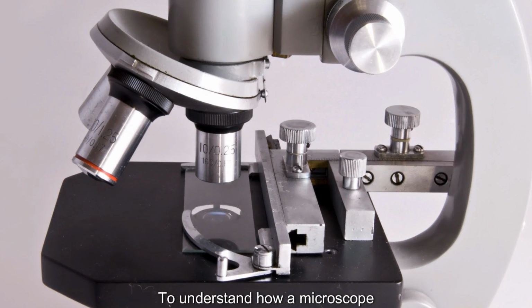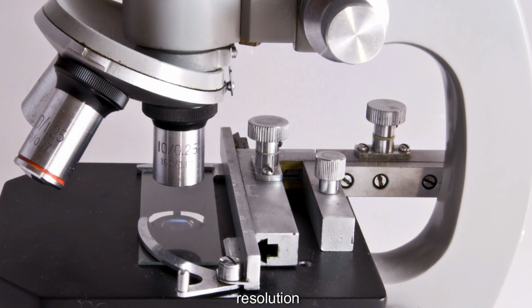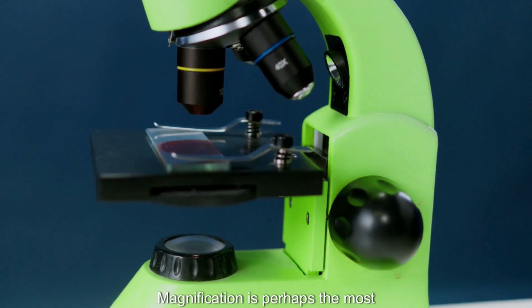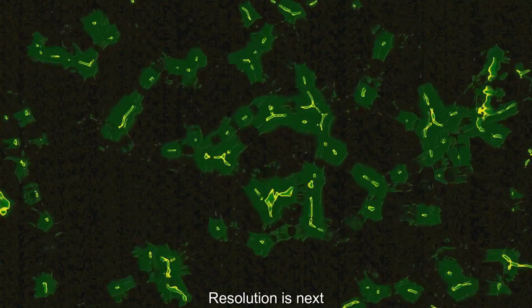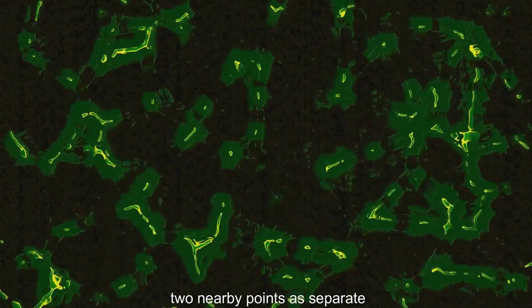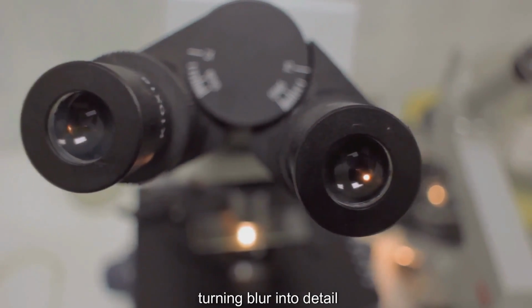To understand how a microscope works, we must first understand three important ideas. They are magnification, resolution, and contrast. Magnification is perhaps the most familiar concept. It is how much larger the microscope makes an object appear. Resolution is next. Resolution is the ability to show two nearby points as separate. Good resolution does that for tiny structures, turning blur into detail.